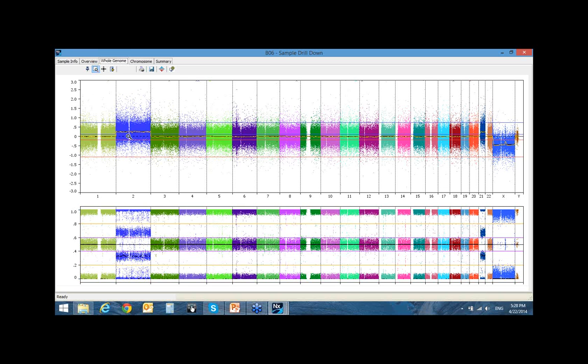You get a copy number gain. Same thing for the trisomy 21 region. You can see we get a 4-band pattern very clearly. And also the other ones, you usually get 3 bands, except here you have some event. You see there's a trail going on in the BAF (B allele frequency) plot.